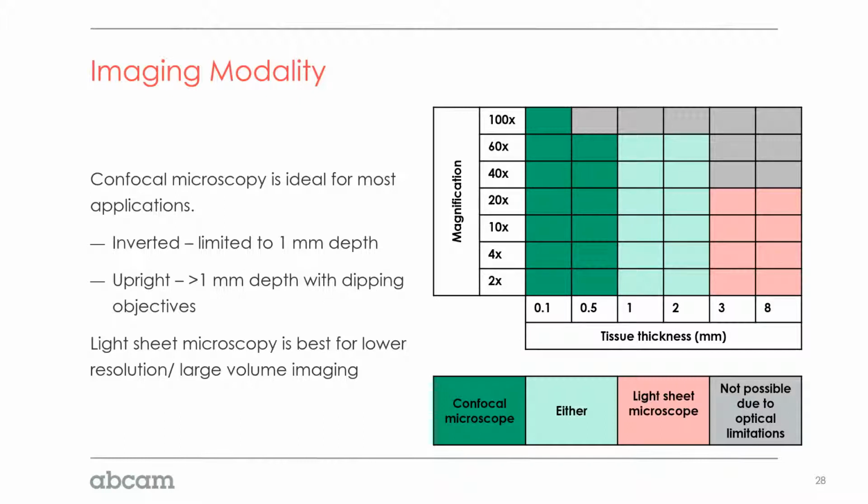However, the problem with light sheet microscopy is that sample prep can be more challenging than it is with confocal microscopy to really match the refractive index, to find the light sheet microscope, as they're not as common as confocal microscopes, and to adopt that into your research project. With confocal microscopes, they're much more ubiquitous. Pretty much every imaging core out there is going to have a confocal microscope that you can use. And confocal microscopes are really best for higher resolution 3D tissue imaging, but smaller volumes.